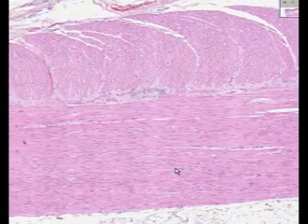myenteric plexus between the two layers, and then the rather loose connective tissue of the outside, which, if this had actual mesothelium, which we could identify, would then qualify it for being serosa or peritoneum. Otherwise, you just have to call this loose connective tissue adventitia. Primarily fat, loose connective tissue. There's a little blood vessel.